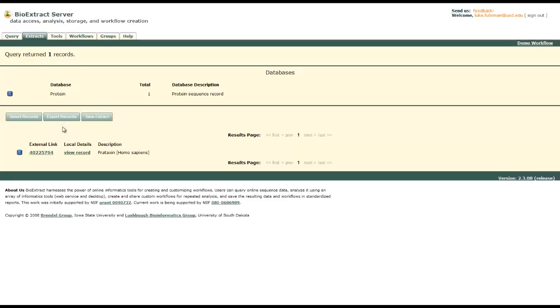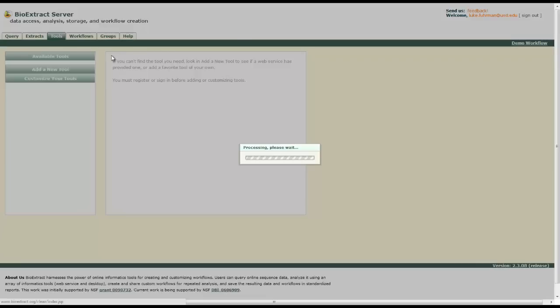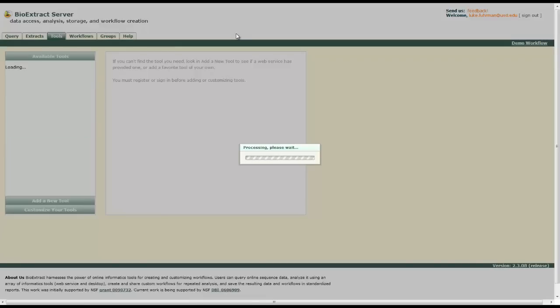Now we will go to the tools tab and use this query in some of our tools. It'll take a little bit to load. There's quite a few tools available through BioExtract Server.